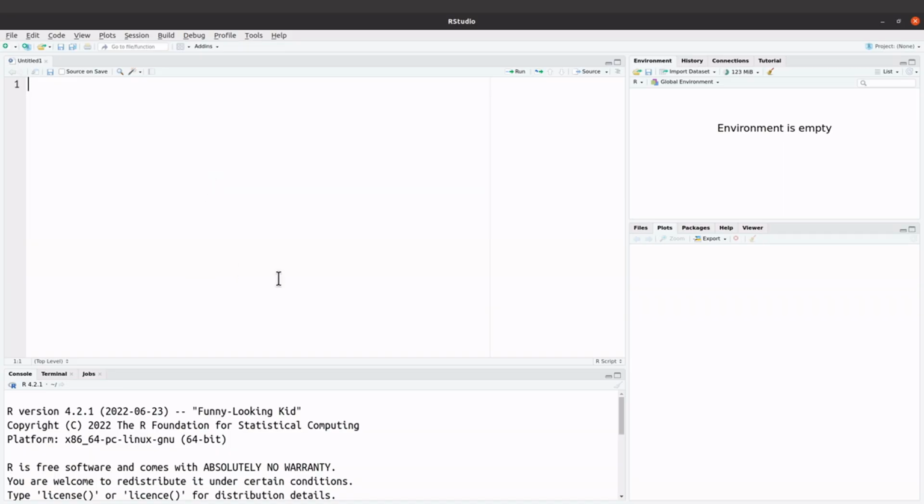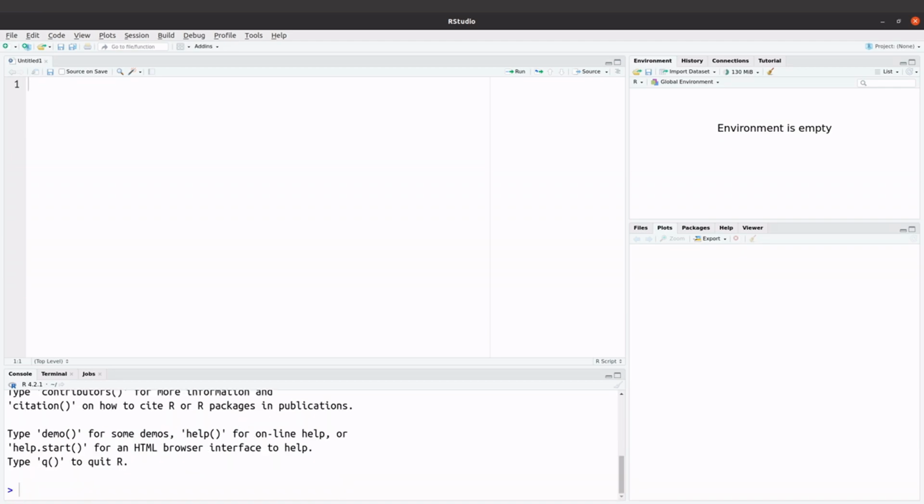So I have that done. So now there's time for the analysis, or the visualization, let me put it that way. With the visualization, I'll start with the SNPs and indels. So I will generate a pie chart to visualize the number of SNPs and indels. So let me first give a comment here. So I'll say pie chart of the number of SNPs and indels.